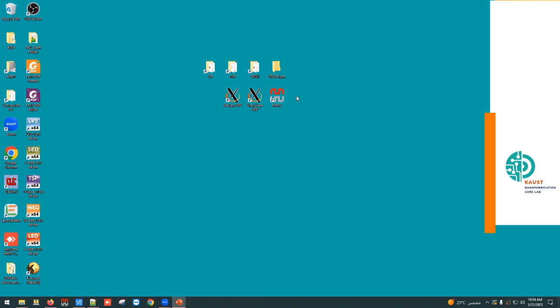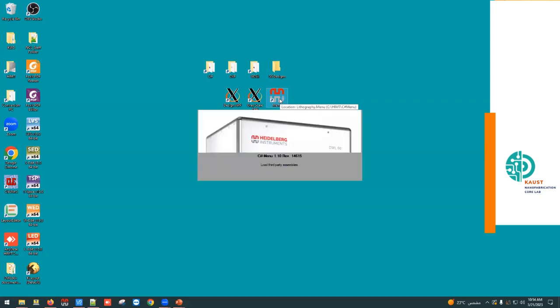So to do the exposure, we need to operate this software. Normally, I think it will be open, but I wanted to show you, in case you have the computer and the software is completely closed, how to open and how to log in, because there are several users. So we double click in menu. Are you seeing now how it's opening? Yes? Okay.